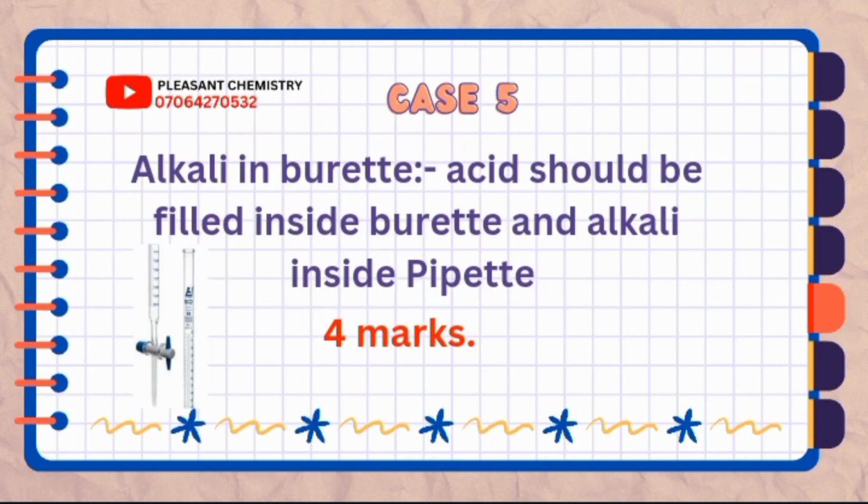The next error, or mistake, that students commit during titration is alkali in burette. When we say alkali in burette, you are supposed to fill acid inside the burette and you pipette the base. So when you put base inside the burette and you pipette acid, automatically you are going to commit a big error, because it is going to show in your tables of value, and it will also show in your TITRE value.